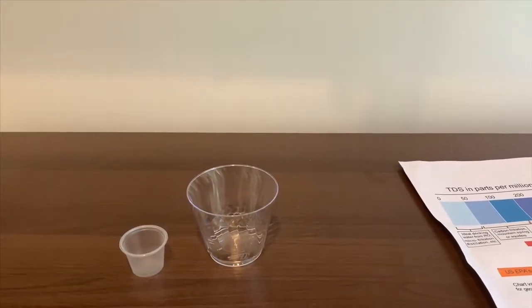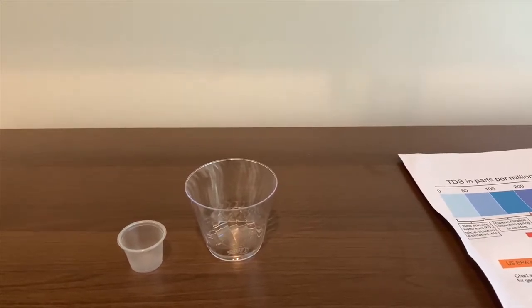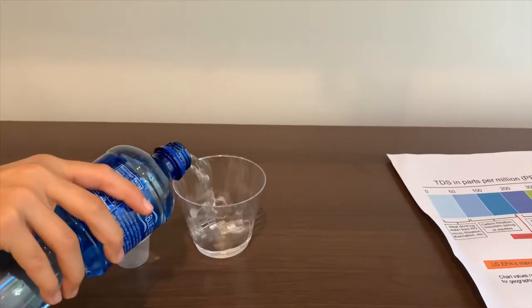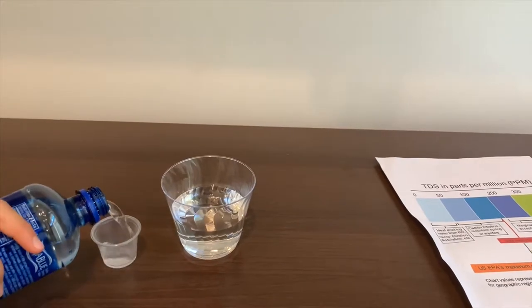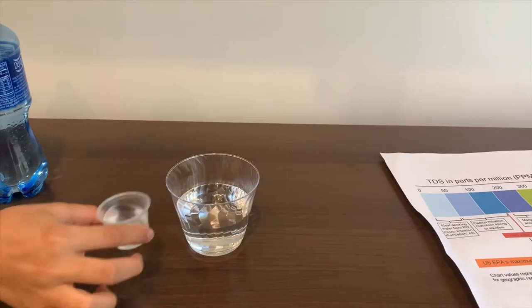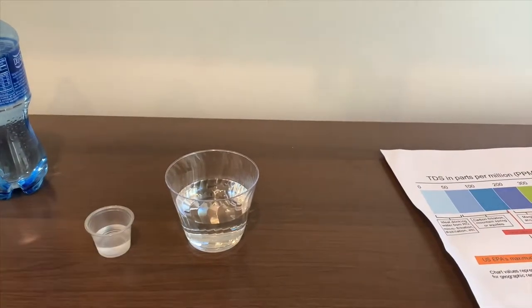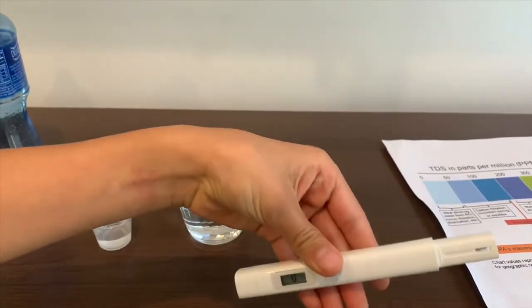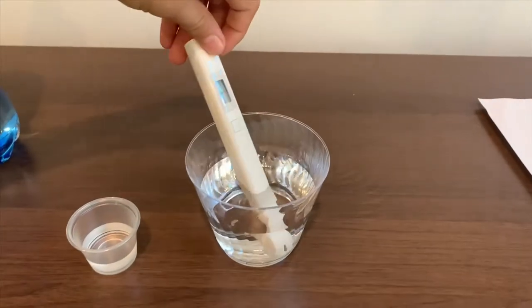Let's test the TDS level first. Let's pour some water in. This is too much water for the pH test. Turn on the TDS and make sure it says zero. Put it in and let's wait.